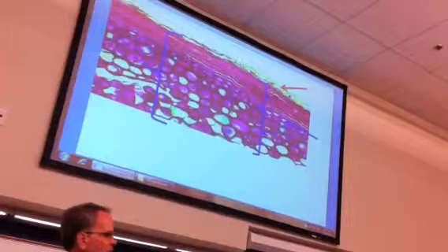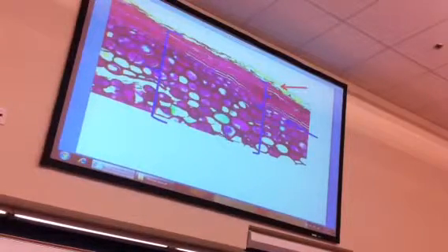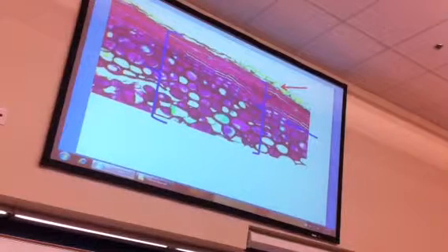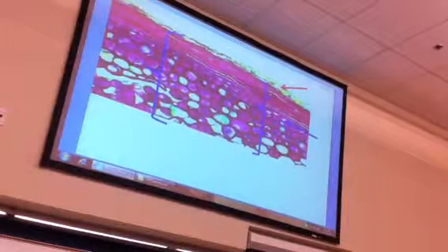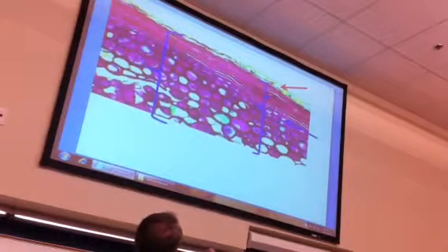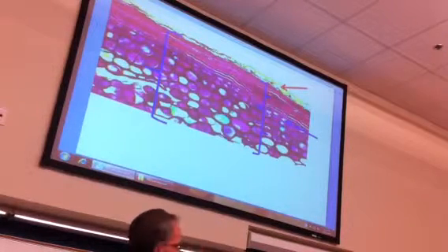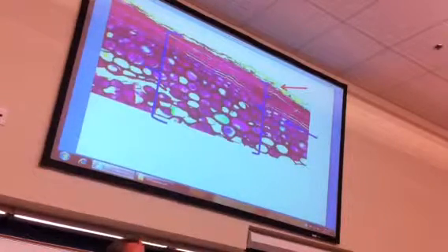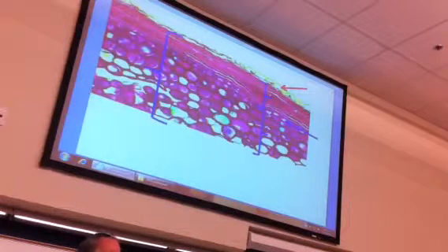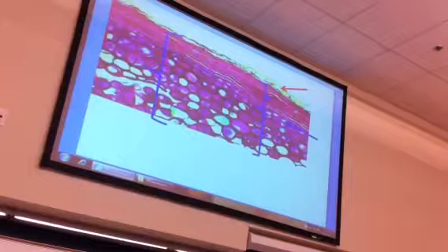So one of the questions in the early part of the lab was, can you see an epidermis in any of these? Certainly when you're starting with the herbaceous dicot stem, the answer is definitely yes. When you get to your 5-year-old stem, the answer should be definitely no. But as it's going through the transition, it's still there, and at some point it's not. You can see here it's present, over here it's thinning out. It's because it's stretched. The tree's growing in diameter and the epidermis is stretched and it snaps and it dies.